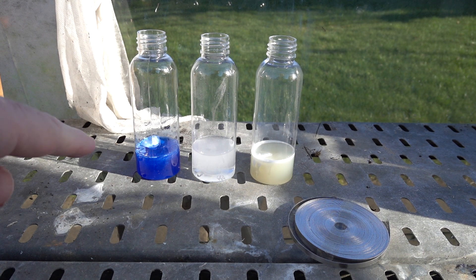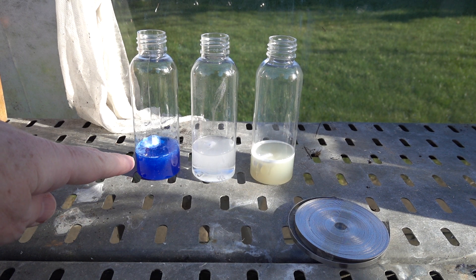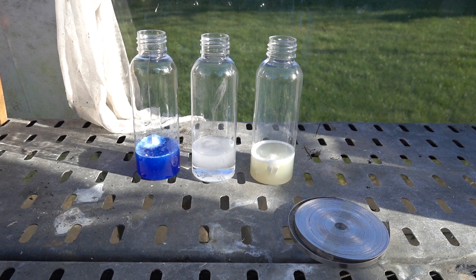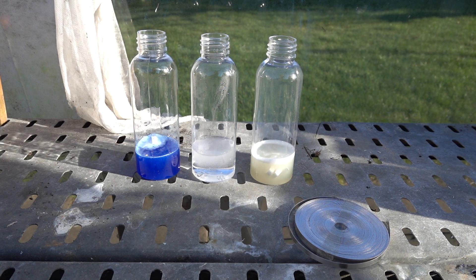As we've seen before, the domestic cleaner has got some surfactant agents in it and it's producing a rather thick foam. Whereas the vinegar — no foam but plenty of bubbles — and the citric acid in the jiffy lemon juice somewhere in between. Probably the lemon juice constituents helping to form that foam there.